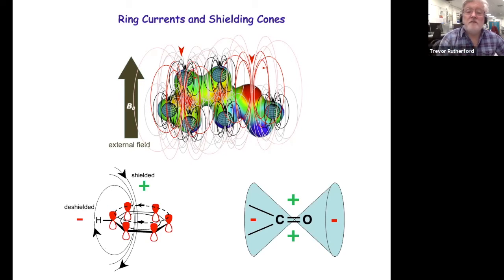If we have none of these magnetic fields in there, then all nuclei of the same isotope would resonate at exactly identical frequency. And the reason that we get a spread of frequencies is because we have this local landscape of magnetic fields within the molecule that becomes so useful for telling us what's going on in there.